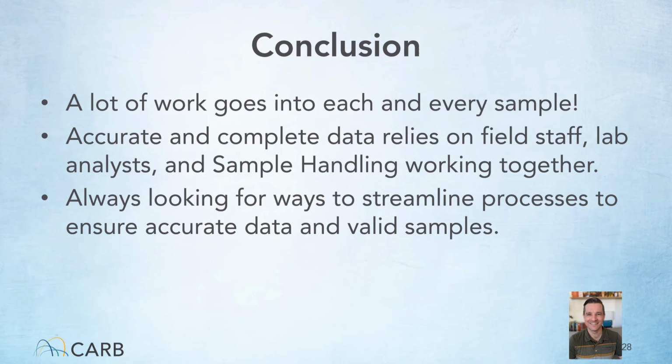To wrap things up, there is a lot of work that we put into every single sample. Dishwashing, sample preparation, data entry, and peer review are all performed with care for each sample that goes through sample handling.